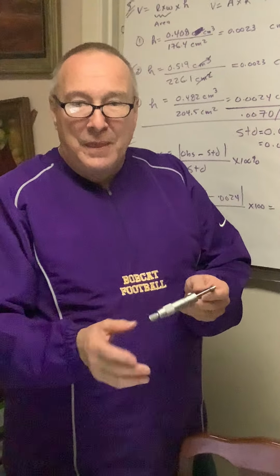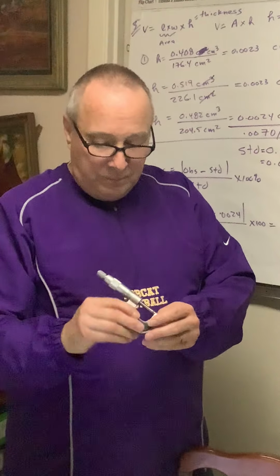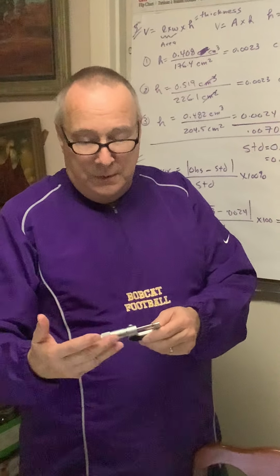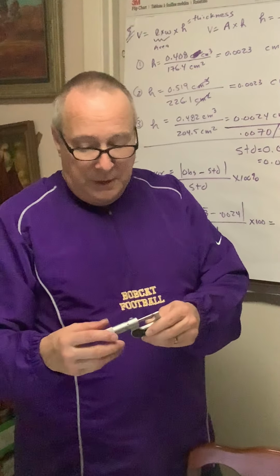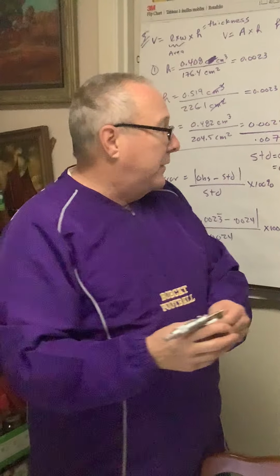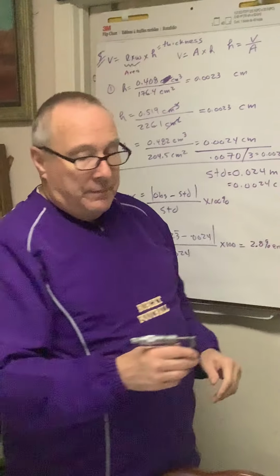I have to teach you how to read a Vernier scale. This one's about 10 years old. Very precise. Measures really to 1/10,000th of a centimeter. But anyway, of a meter. So 1/10 of a millimeter. So it's really accurate out to that many places.